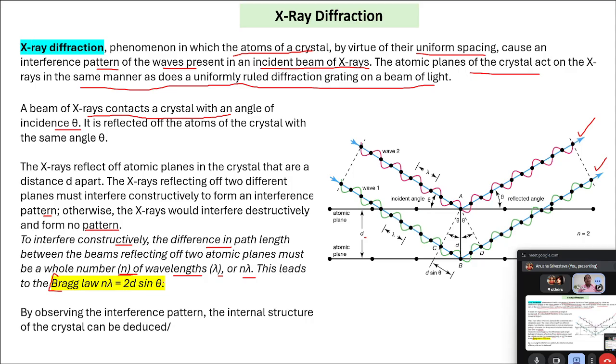So this is some of the core physics that we studied in class 11th and 12th, the X-ray diffraction, Bragg's law. I would not dwell too deep into it, but I would just revisit the concept once, and then I will be directly coming to how XRD is used as a nanoparticle characterization methodology.